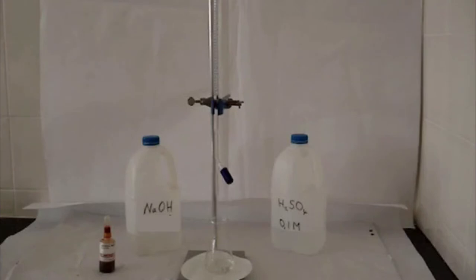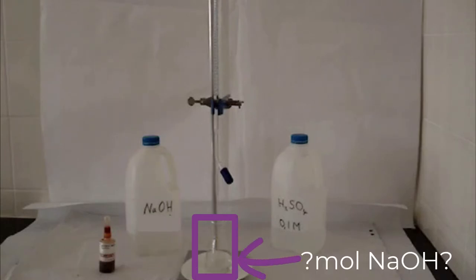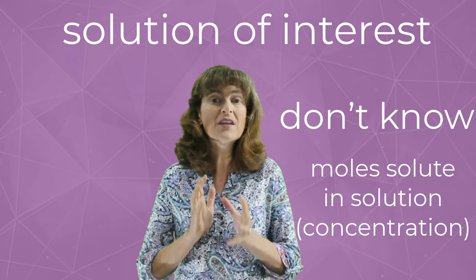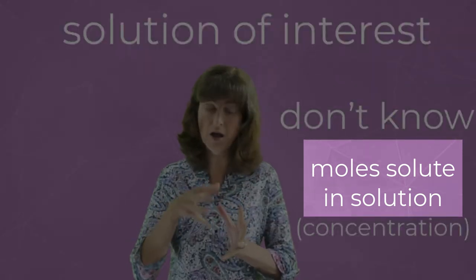For example, here, we know that our solution of interest is a sodium hydroxide solution, but we don't know what its concentration is. So we pour a certain volume of the solution into a conical flask. If we could find out how many moles of sodium hydroxide are in there, then we could divide that by the volume that we'd poured into the flask, and then we'd know the concentration of the sodium hydroxide solution of interest. We perform the titration to find out how many moles of sodium hydroxide are in there.